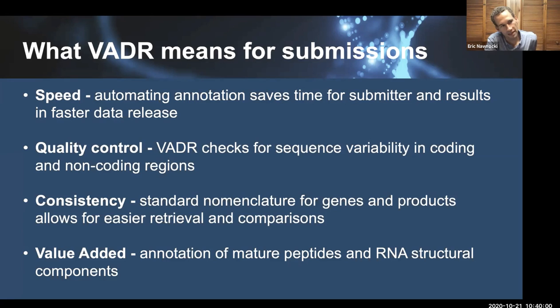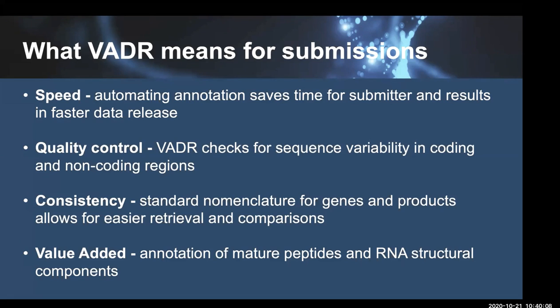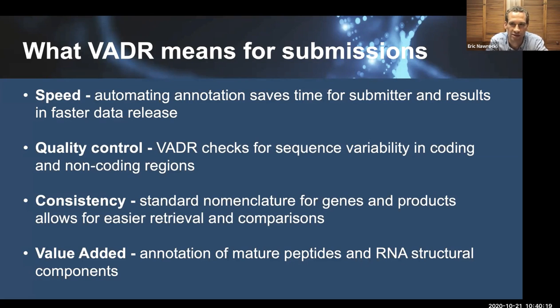Yeah, that doesn't exist now, but it can definitely be done. So I will work on that so it outputs GFF. For now, there's an output file .ftr. It's like feature information. If you need it earlier than that, that's probably the easiest file to parse to get to GFF. Thanks. Yep.